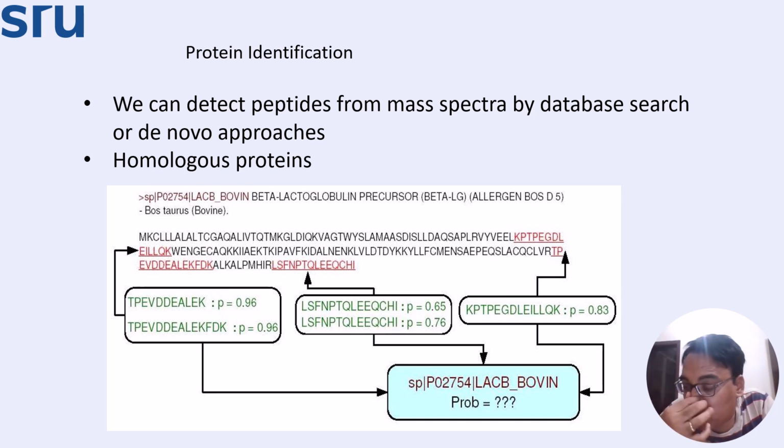So many times, rather than a complete conserved fragment being present in a given peptide fragment, only a small fragment is there. Rather than this complete part being there, only this is there. But you realize that this exactly overlaps, so this should be correct. Yes, so this is a probability score. But now if you consider that statistically, tell me what is the probability that this threonine is present at first position?